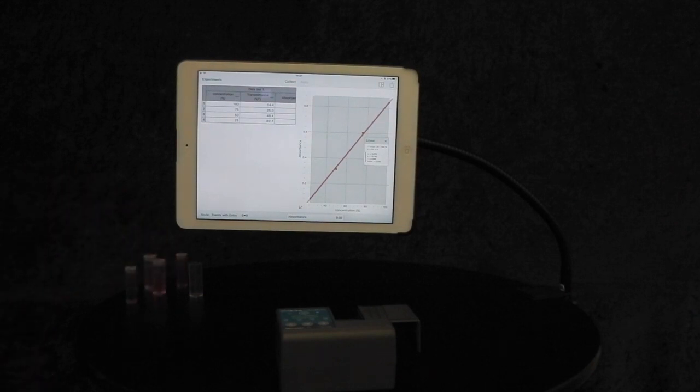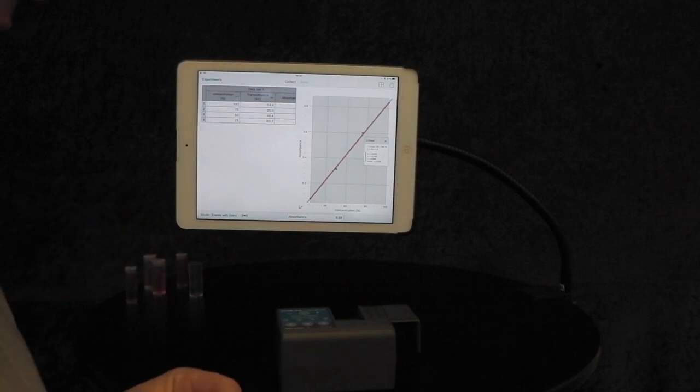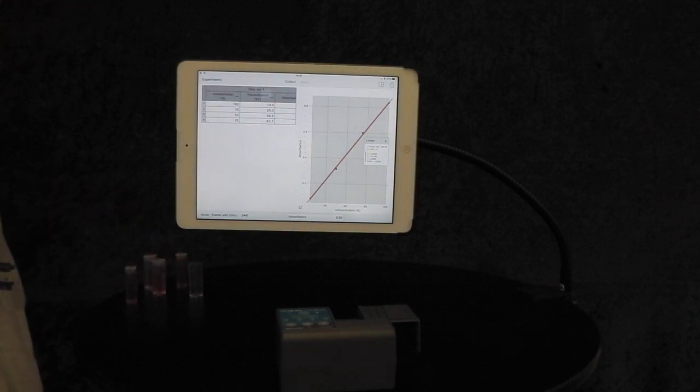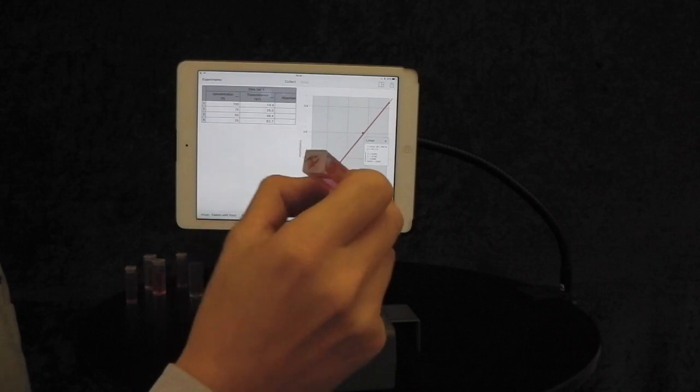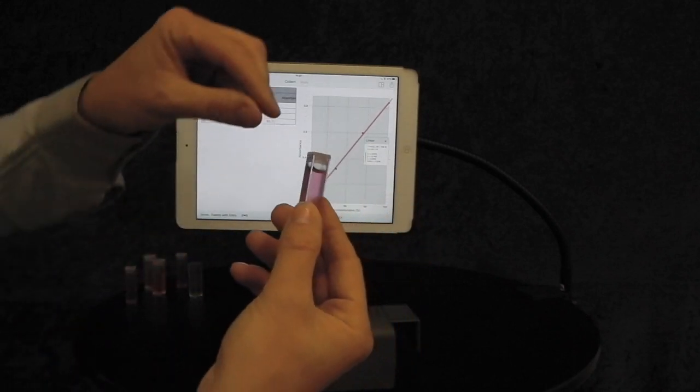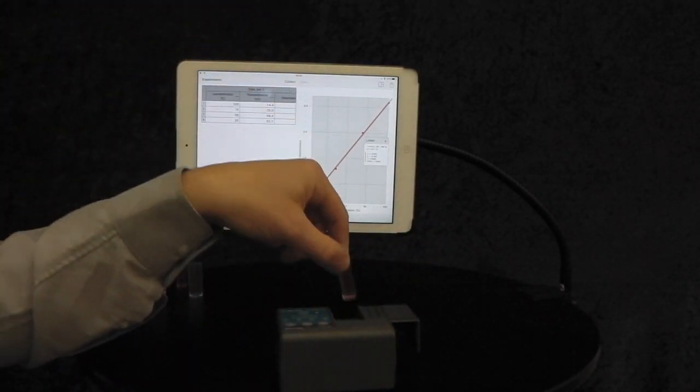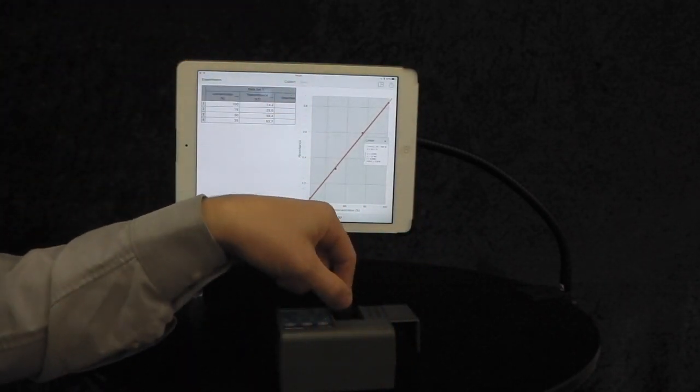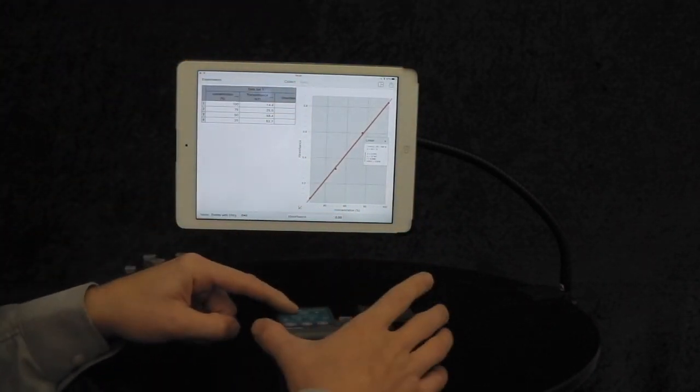We can now add an interpolation to the line as well. Now to test this, we need to now put in our unknown, which I've got here, which I've just labeled as A.